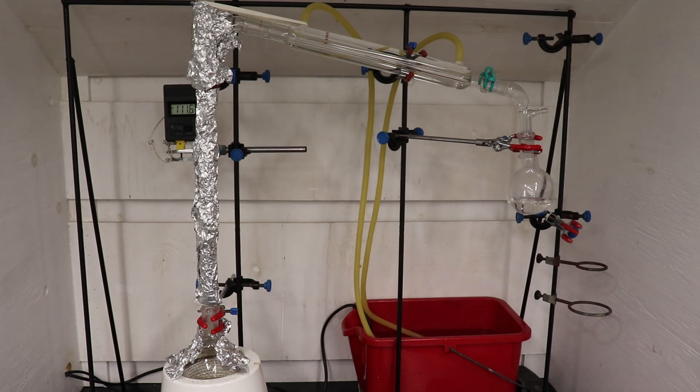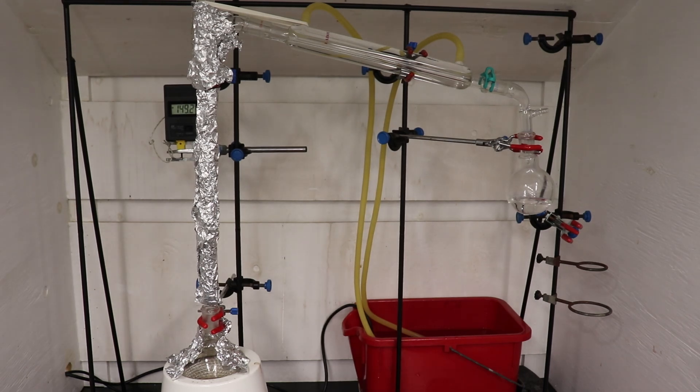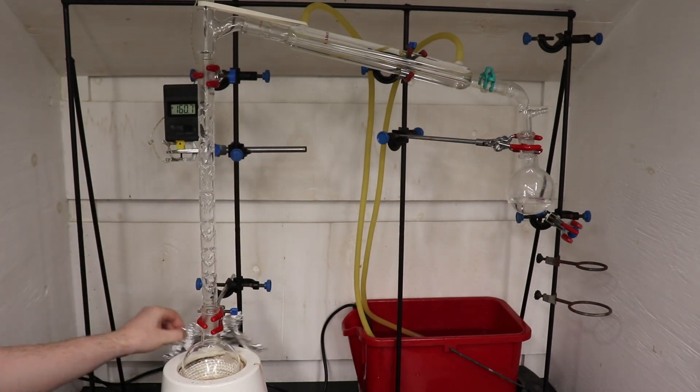At this point, you would typically switch out the receiving flask, and collect your product. However, what I did instead, was remove all the aluminum foil, and drop the mantle, to quickly stop the distillation.